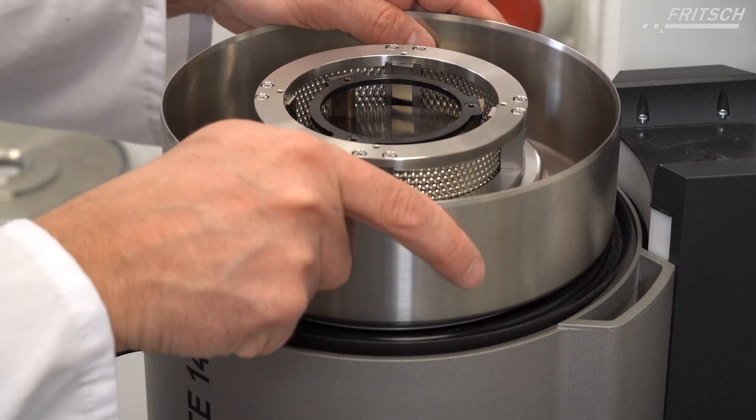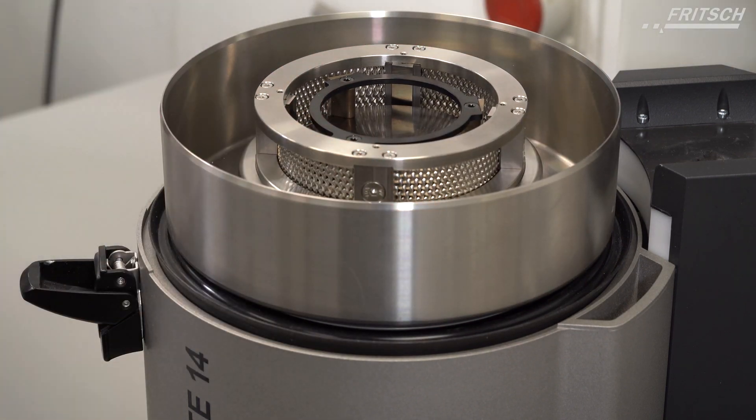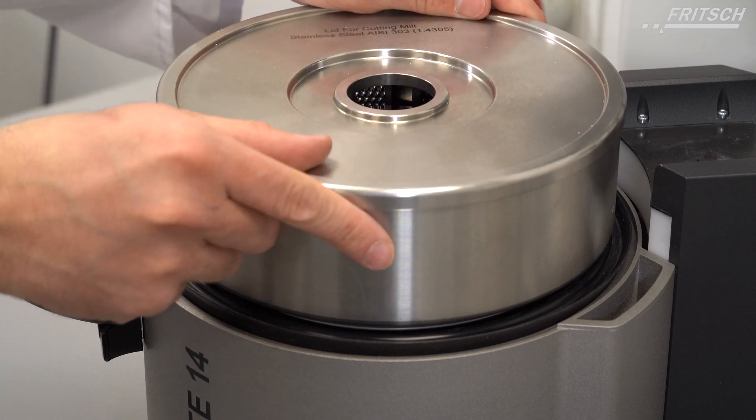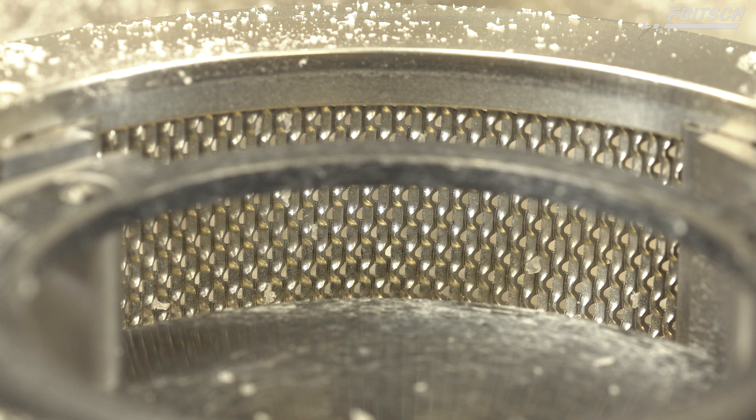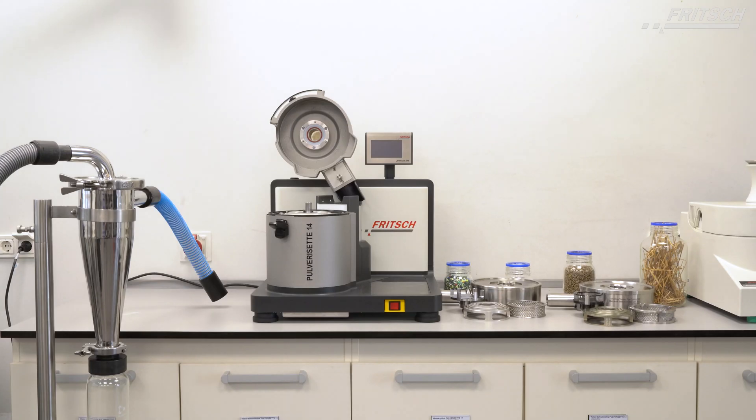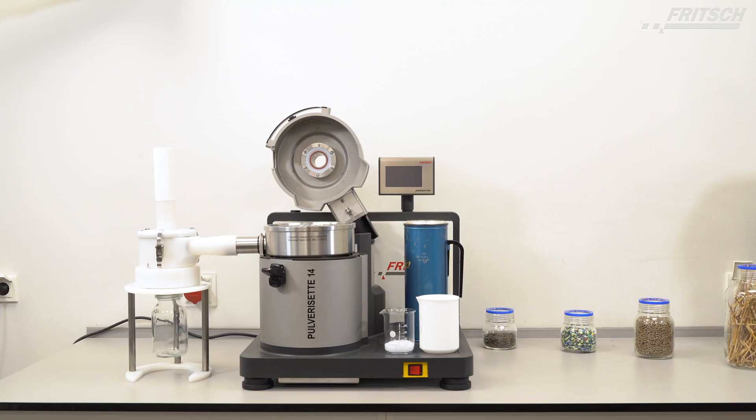The cyclones are ideal for temperature sensitive samples and materials which are otherwise difficult to grind finely, such as electrostatically charged plastics or powder coatings. Fritsch offers two models: the high performance cyclone separator and the small volume cyclone separator.